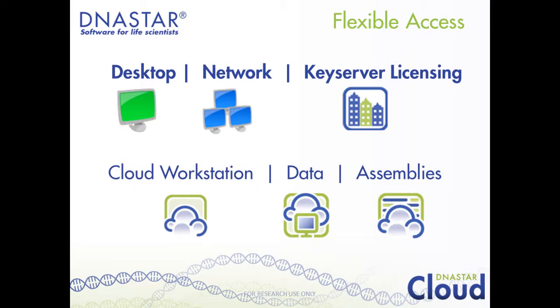All of this software is available on a variety of licensing and access configurations. We provide extreme flexibility in licensing, so you can use a desktop or network license, and all of the software is also available on the ground or on the cloud, which really allows you to take advantage of some unique configurations for storing and sharing your data, accessing your projects from anywhere, as well as running some larger next-gen assemblies, for example, without investing in a lot of hardware.